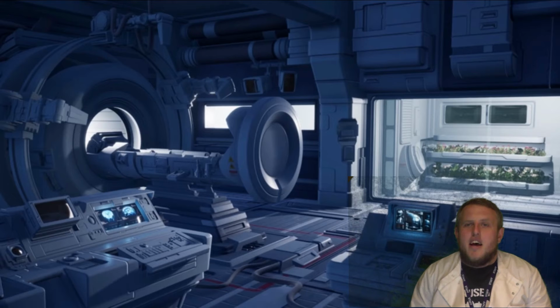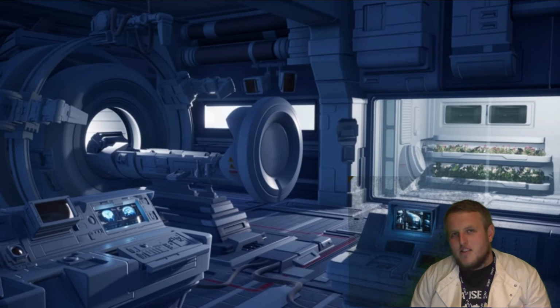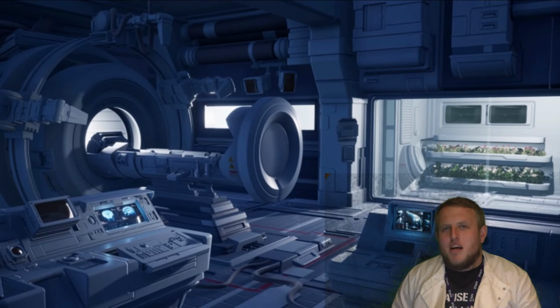You could set your hair or your clothing on fire with a Bunsen burner. You could burn yourself on the hot equipment. You could slip on spilled liquids, or you could cut yourself on broken glass. Those are the risks. Controls are that you will make sure your hair is tied back and that you don't have any loose clothing for the Bunsen burner.